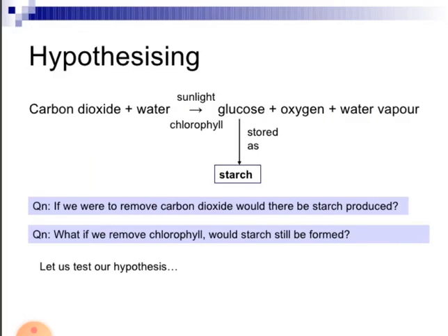Now, when you perform the iodine test, you place the leaf on a white tile and introduce a few drops of iodine solution onto it. You are expected to observe either purple or blue-black coloration to show the presence of starch in the leaf.